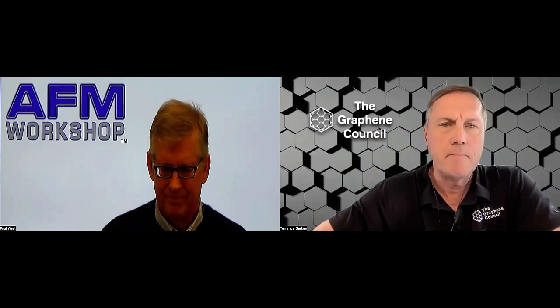Okay. Another one, which I'll interpret different ways, was about holes or defects in a particular material. So basically the morphology: are there some morphologies of material that are a little trickier? For example, if you had a single layer of graphene, but you had a defect in the middle of the flake that was maybe a couple of atoms across, is that something that would be picked up? How sensitive can this get?